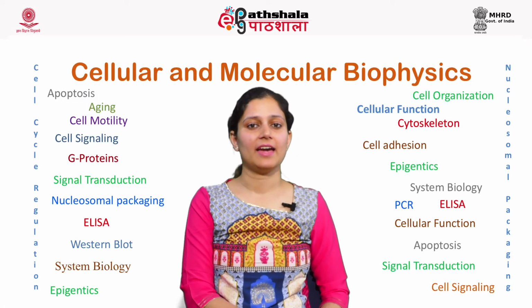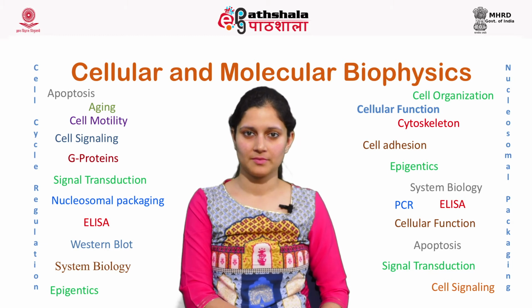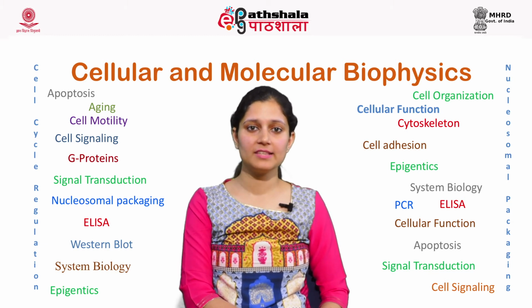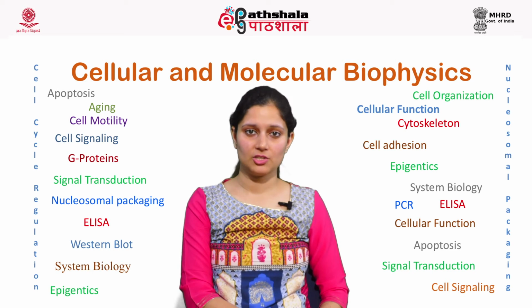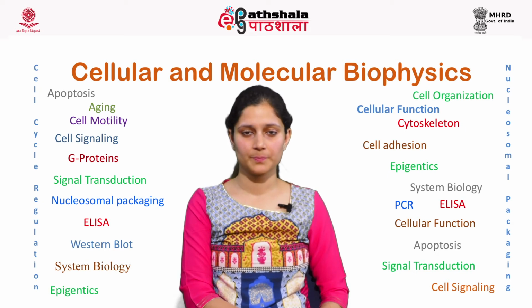Now let us understand and study the different components of a PCR reaction. We have already studied the 3 steps, that is denaturation, in which the double-stranded DNA separates into 2 single-stranded DNAs.